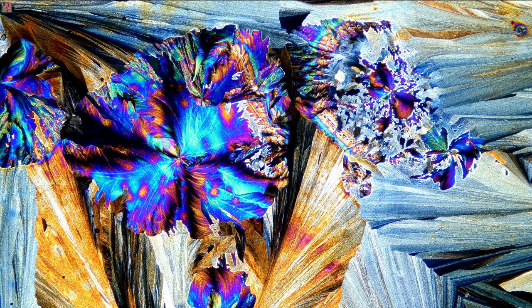Right now we're using the 2X. I'm actually not sure. So the best wave plate to use for this is actually a quarter wave. Not sure if I have that one around right now. Got my other cheap condenser on the ground. That's not a problem. But let's see. Well, we can use the full wave plate here.